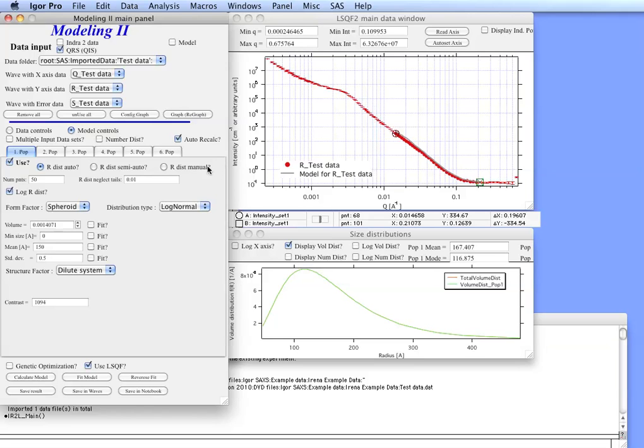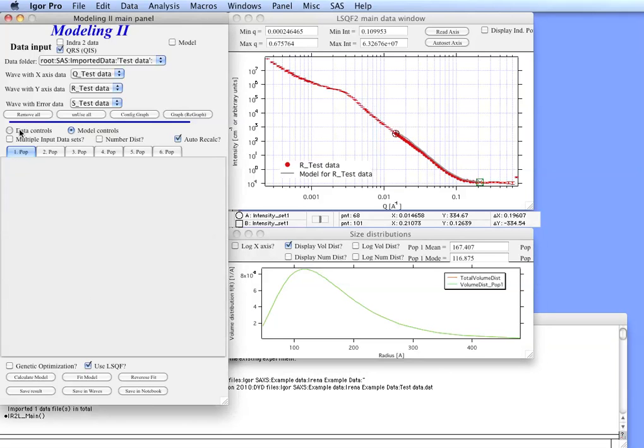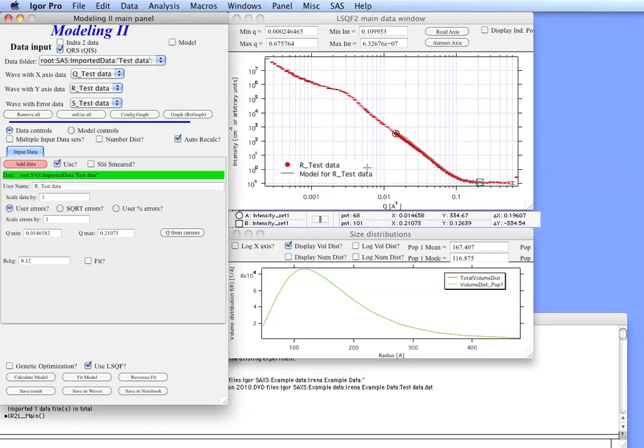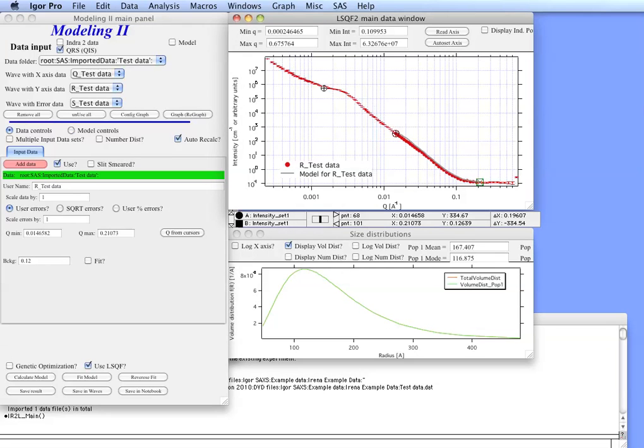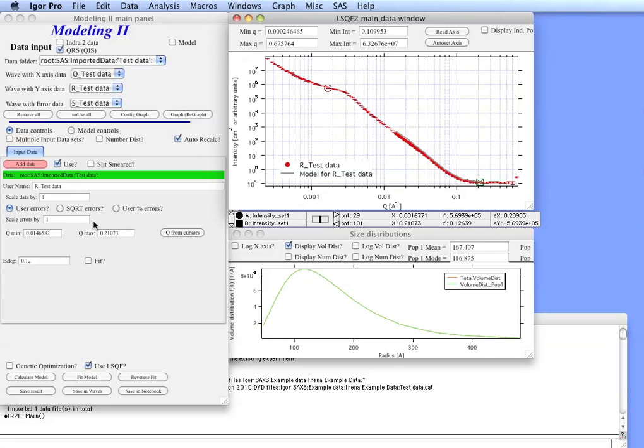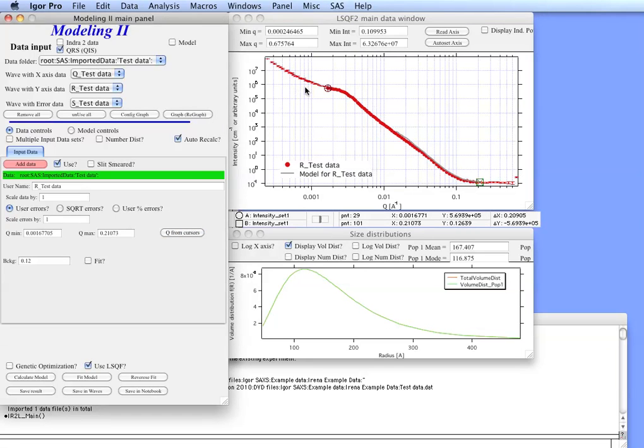So next what we can do is go back to data controls and select a wider range of data. We can go from somewhere above here, maybe 0.29 or so, to get the full Guinier area here, and then select the area down. So we can read Q from cursors and you can see that the points were extended.